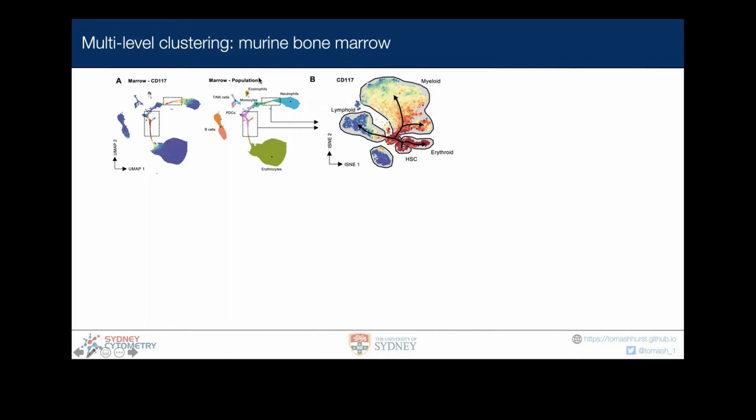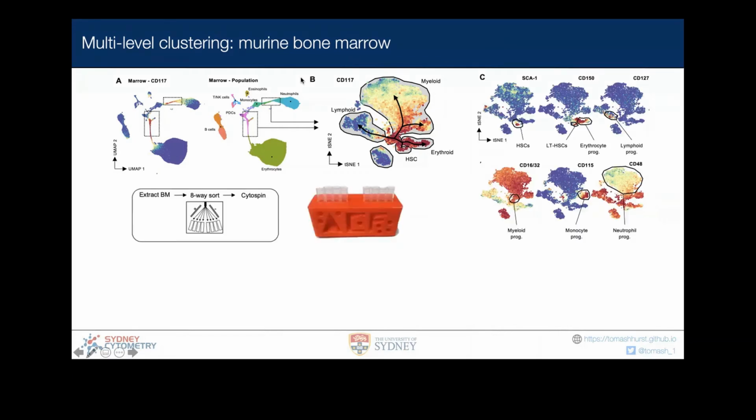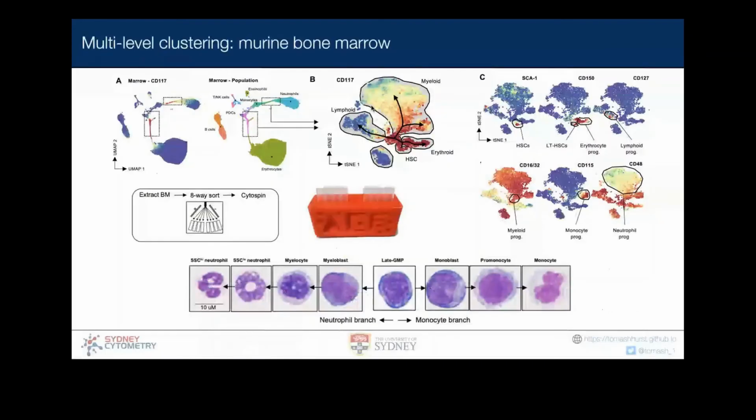So we can do this analysis at multiple levels, which allows us to have quite a bit of granularity for the way that we do this work. And this is important because subtle differences, particularly with progenitor work in this case, matter. They matter in terms of the way that we're able to split up lineages, go on to sort cells and figure out what they are. These subtle differences are important, but they're not obvious when you're looking at the data set as a whole.